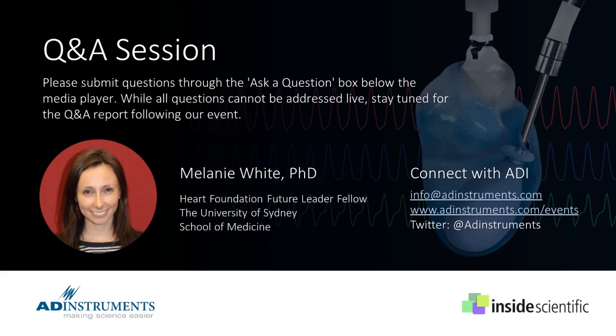It's a really important question. And although it's outside my area of expertise, what we can do is consider that coronary function, which is measured by Langendorff, relies on the coronary vascular reactivity. So therefore, it would seem that it is still an appropriate and valid method to study coronary vascular reactivity.